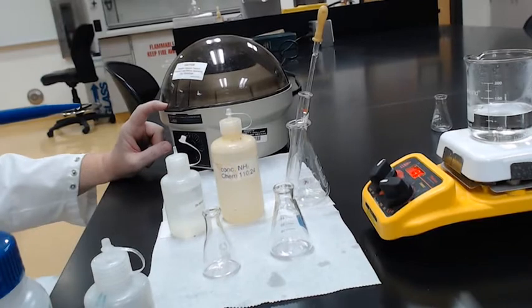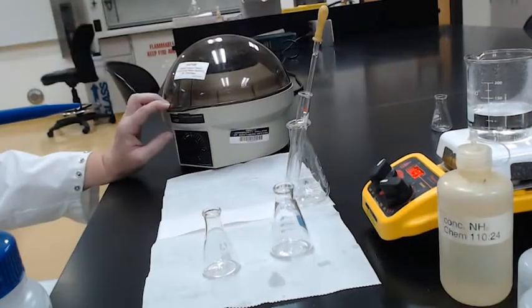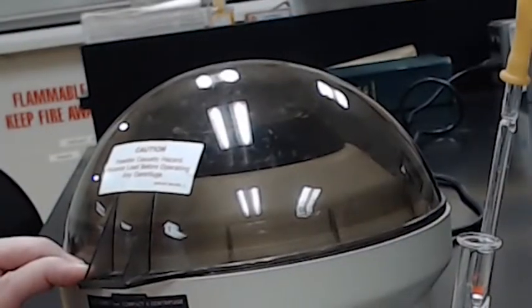And you'll listen. This one's out of balance. The centrifuge will gain speed and gain speed. And now that it's at high speed, you want to centrifuge it for 30 to 60 seconds. Okay, and we're going to call that good.